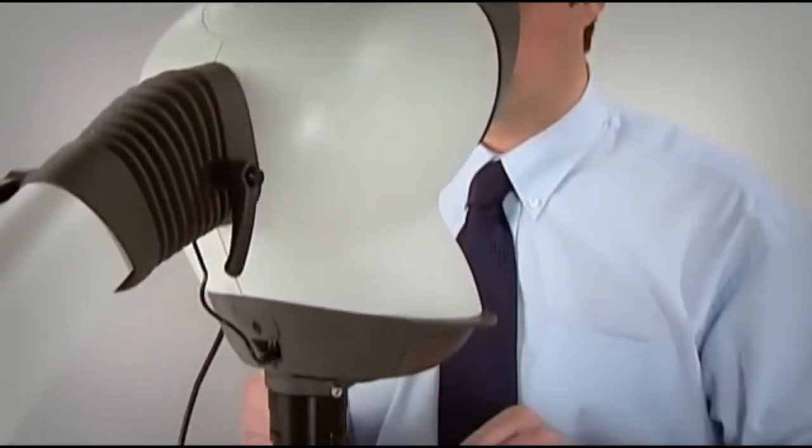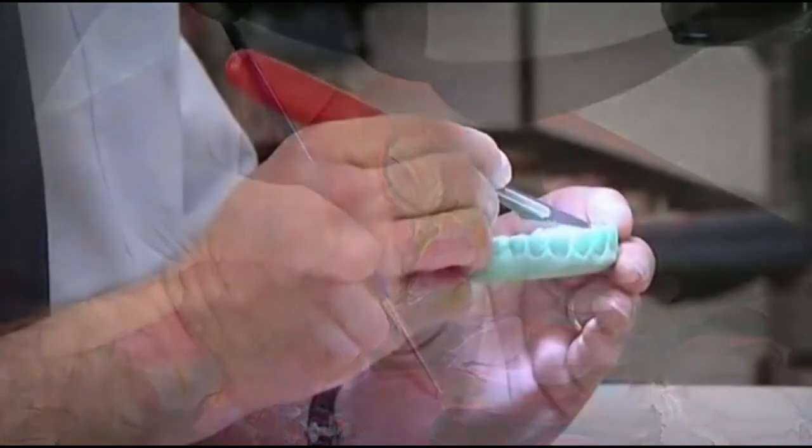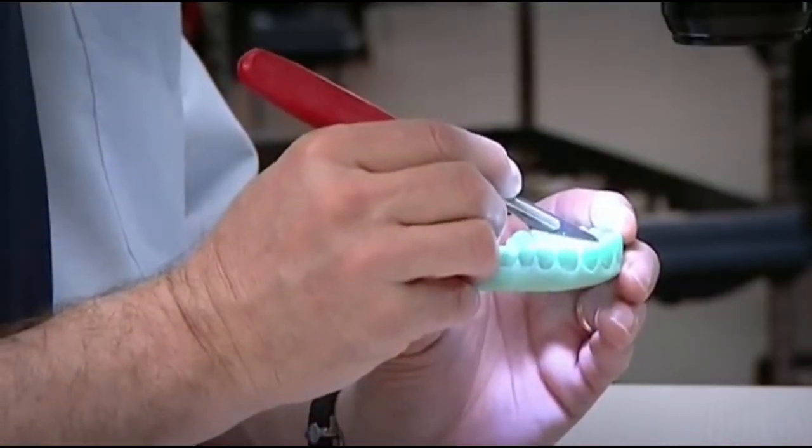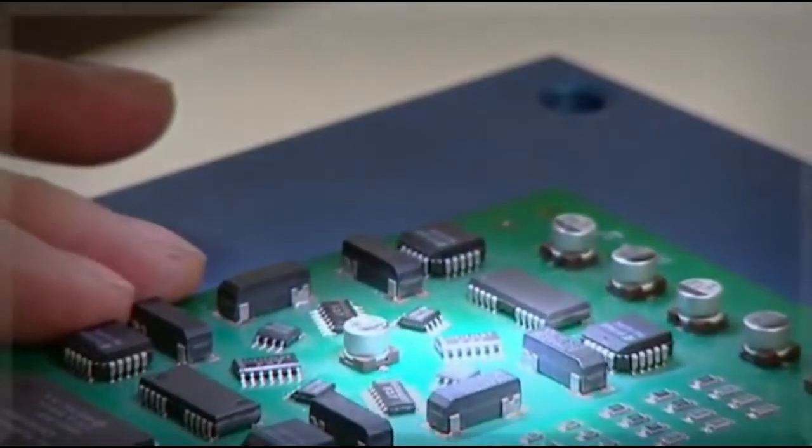The Mantis is a general-purpose stereo viewer used in production, inspection and manipulation, which can be used for any task which requires magnification.